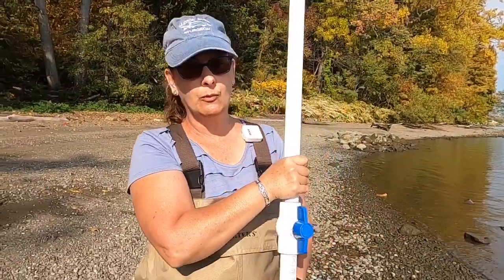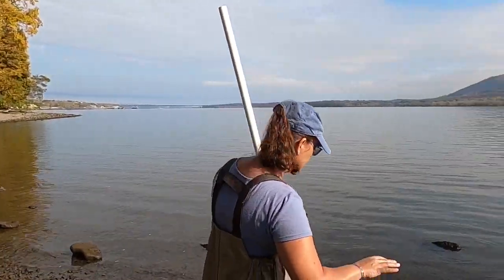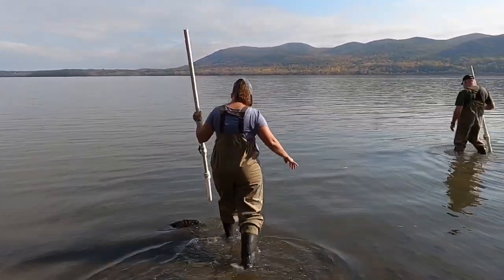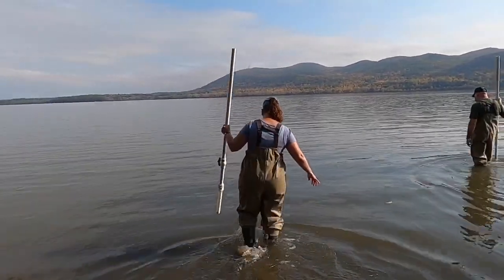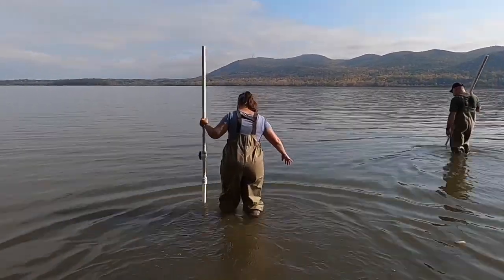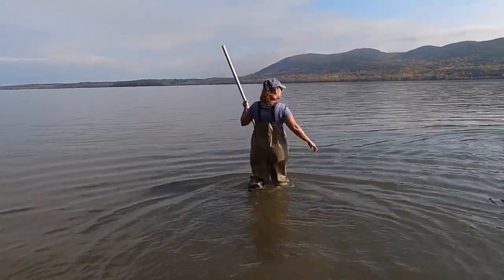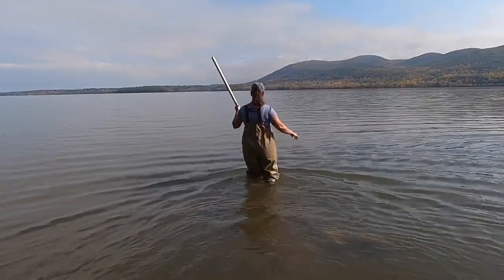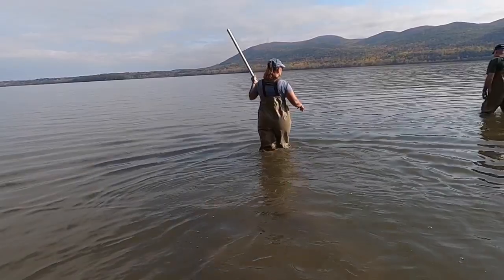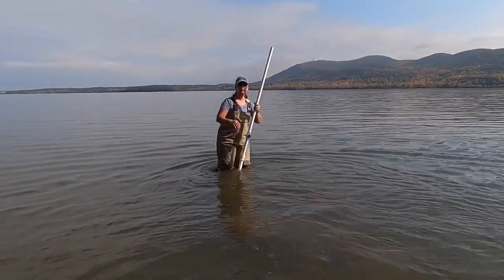I'm going to go out into the water. We're at low tide right now, but there are some random rocks. I'm going to drag my feet a bit to make sure I don't trip on any of those rocks and end up in the water. What we're looking for is sediment that's a little bit more mushy, not so rocky, so we can get the end into it. We should be good right here.